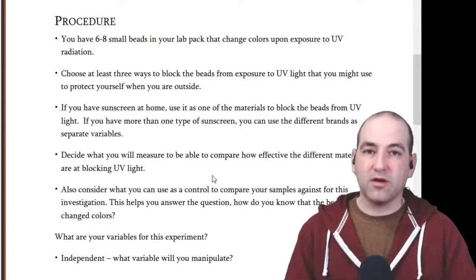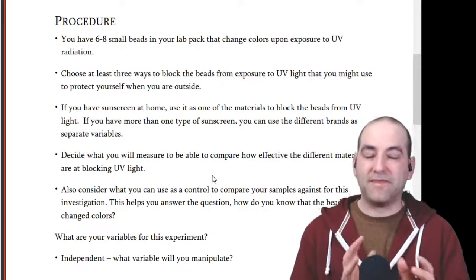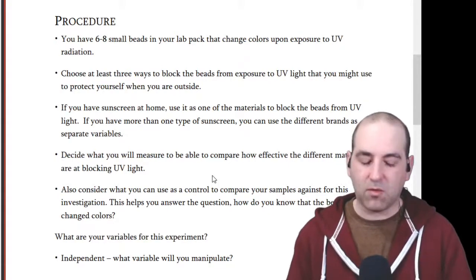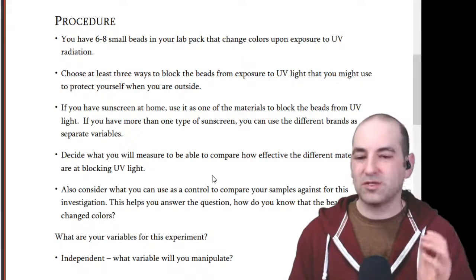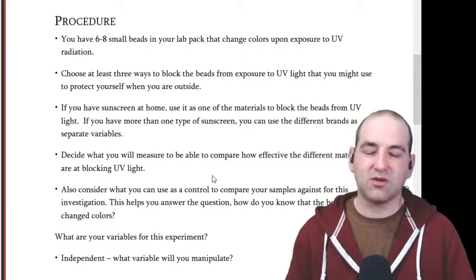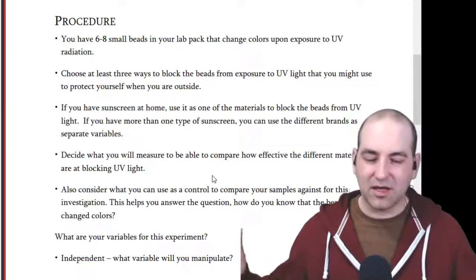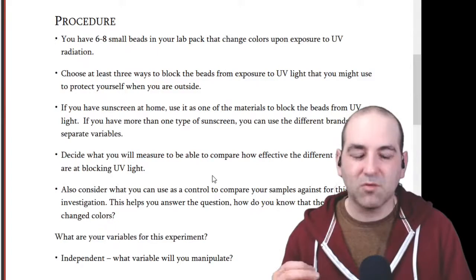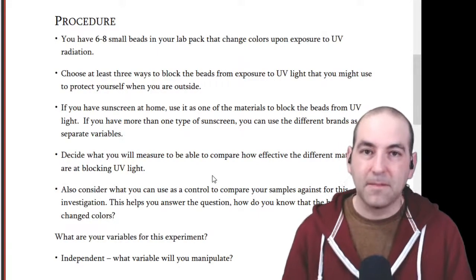And then remember, another important part of science is reproducibility. So once you've got all those things dialed in, you've got to watch it for 11 minutes and whichever one's the control is going to change in 2 minutes. So if it gets to 11 minutes, then it's a good block or whatever it is. I'm just making up numbers.